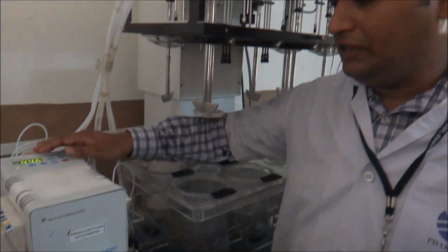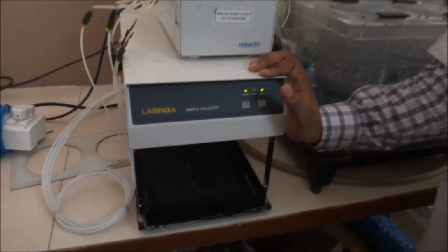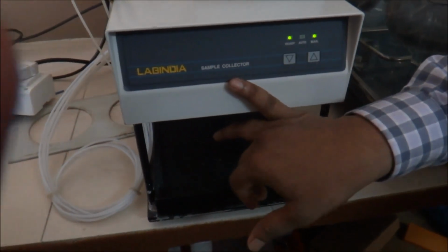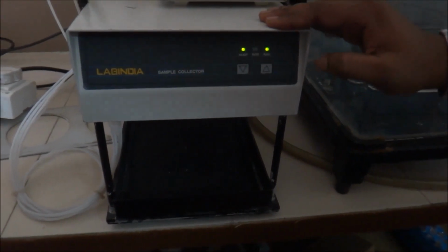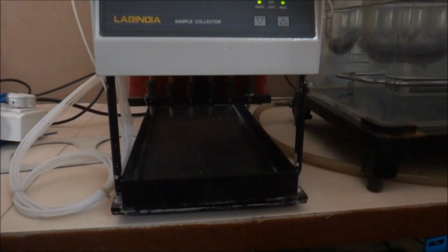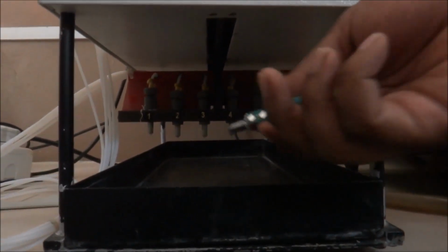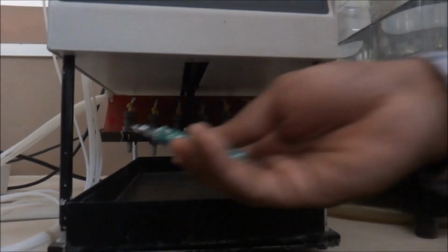Now from this we are coming to this particular component which is also visible for you, and this is called the Lab India sample collector. The purpose of this collector is to withdraw the samples into the containers into which you want to collect the samples. As you can see, we have got 6 baskets, 6 samplers to collect the samples.